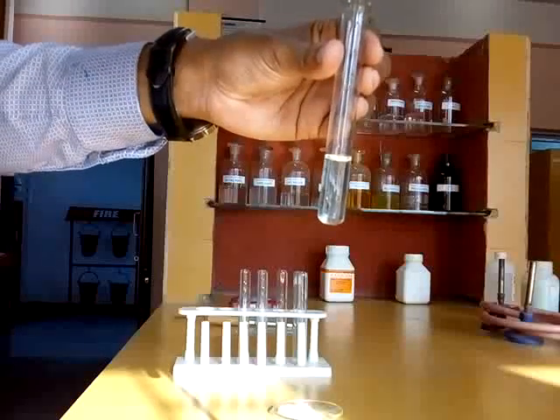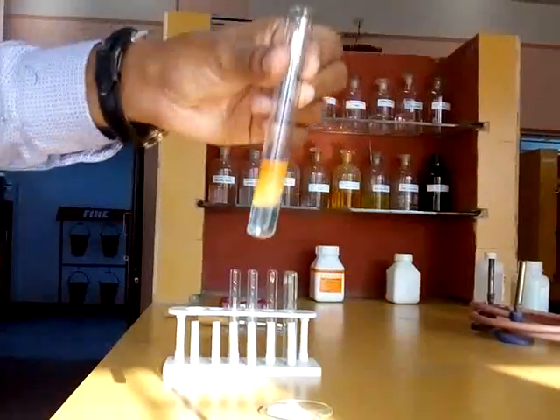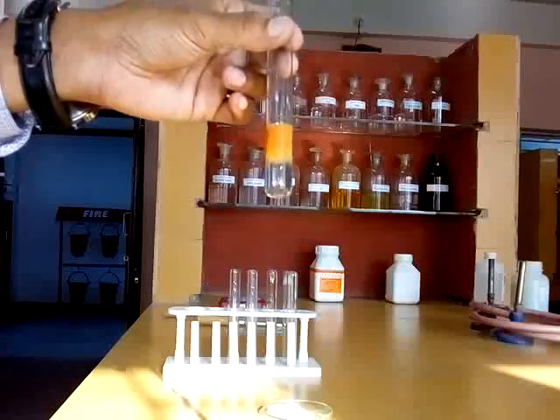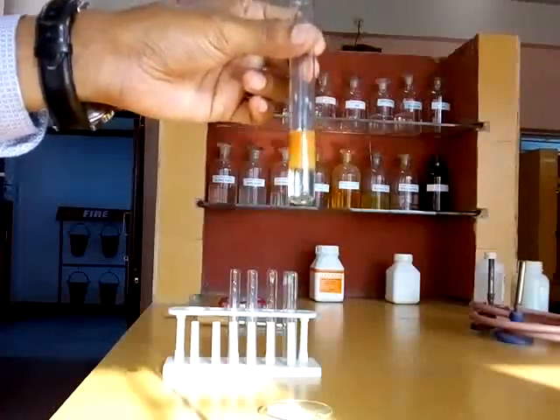You add here two or three drops of Nessler's reagent. Here we got brown precipitate. So here group 0 is present. In group 0 ammonium is present, so our basic radical is ammonium and it is confirmed.